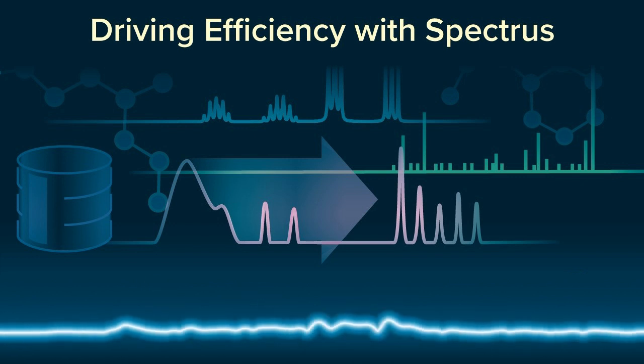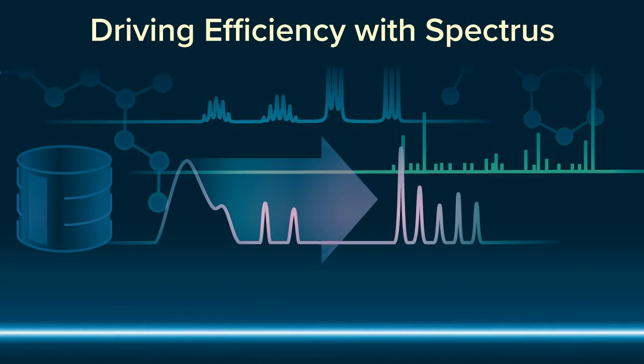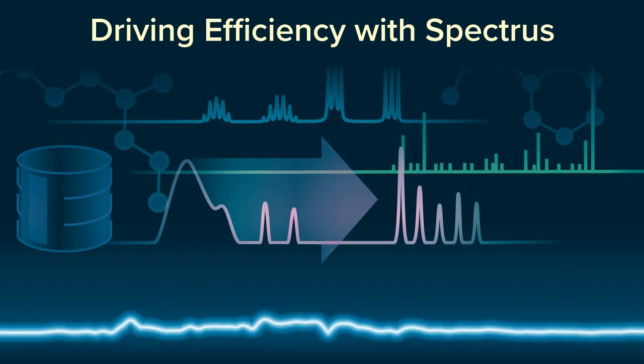And where we are seeing a trend of analysis not being right first time, have we got structured problem solving measures in place to really allow us to understand what the root cause of that potential problem might be? And are we setting clear expectations on our scientists and our users of instruments about how they look after the instruments, how they're trained to use them so that they understand the instruments well enough so that they can do basic troubleshooting, but not necessarily be super engineers in being able to fix everything.